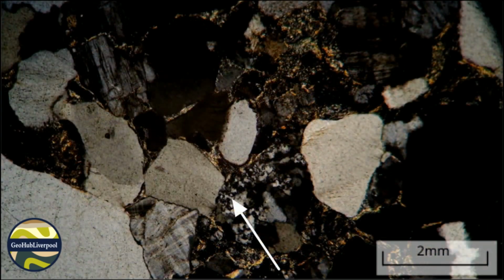This grain is a rock fragment. It is a polycrystalline quartz grain made of interlocking quartz crystals. These grains are usually sourced from metamorphic rock.